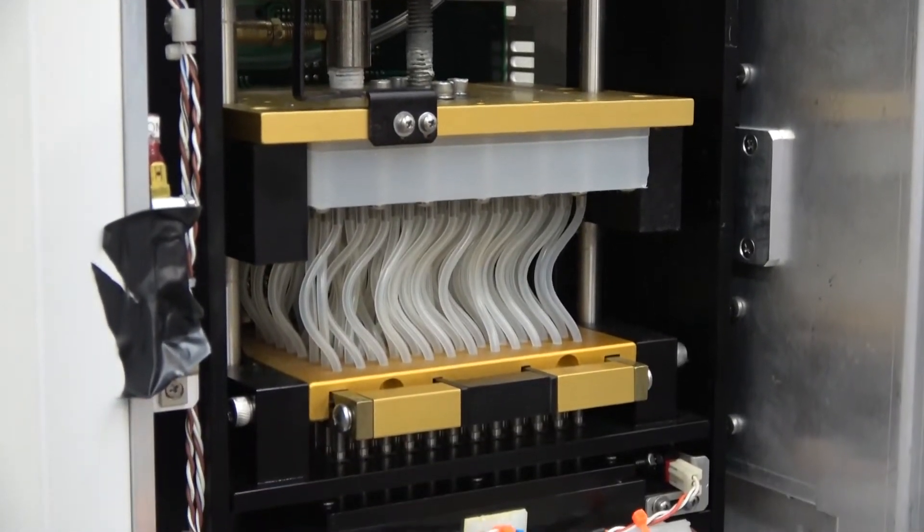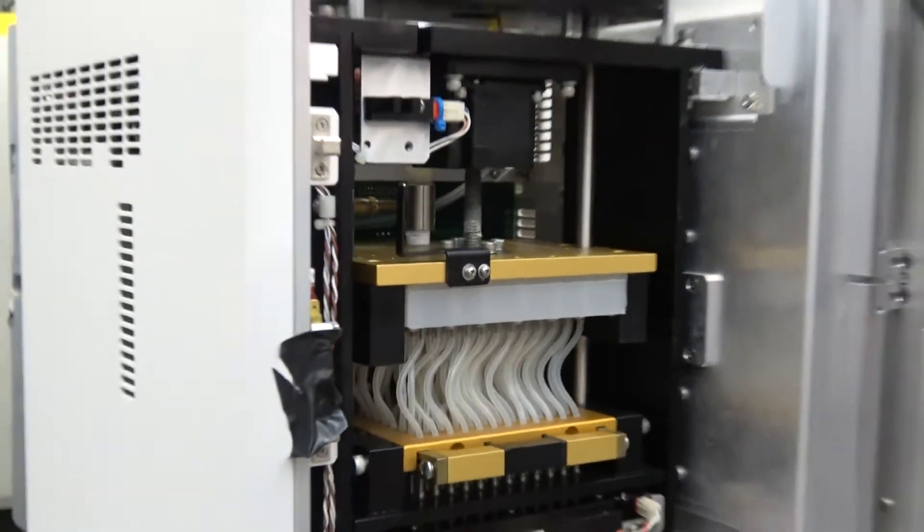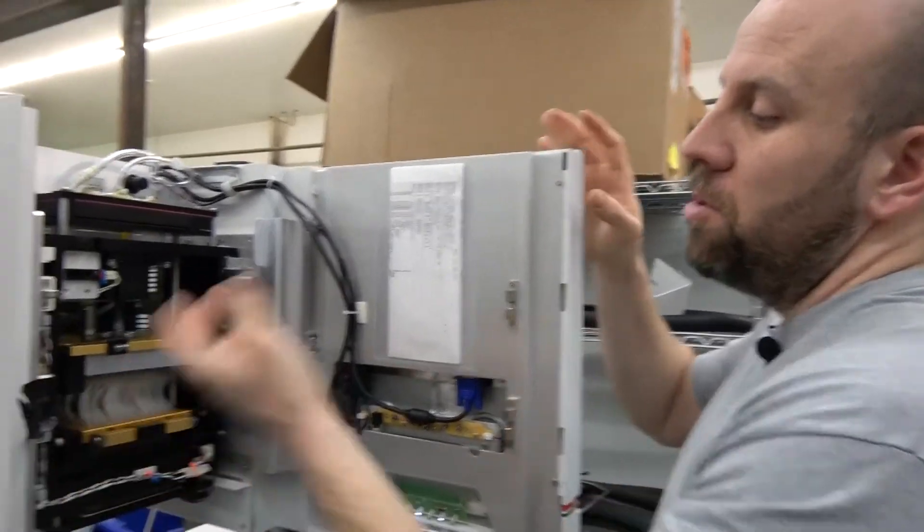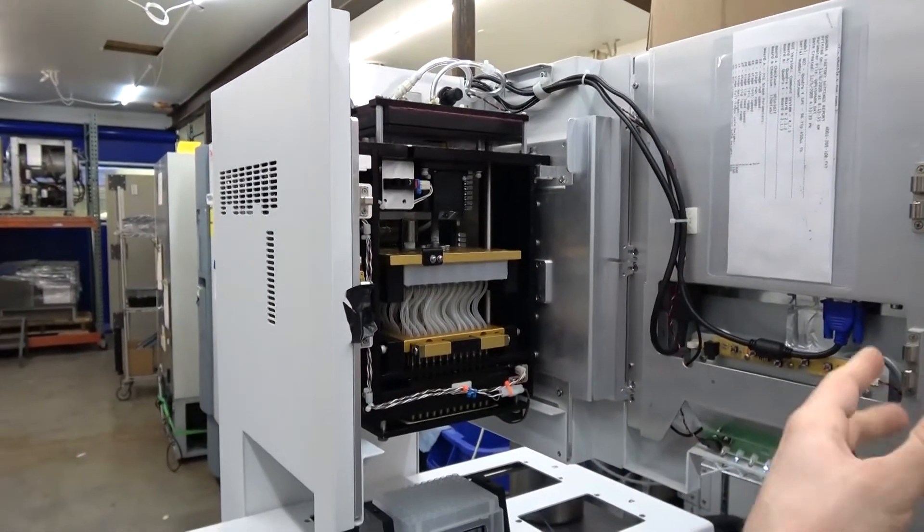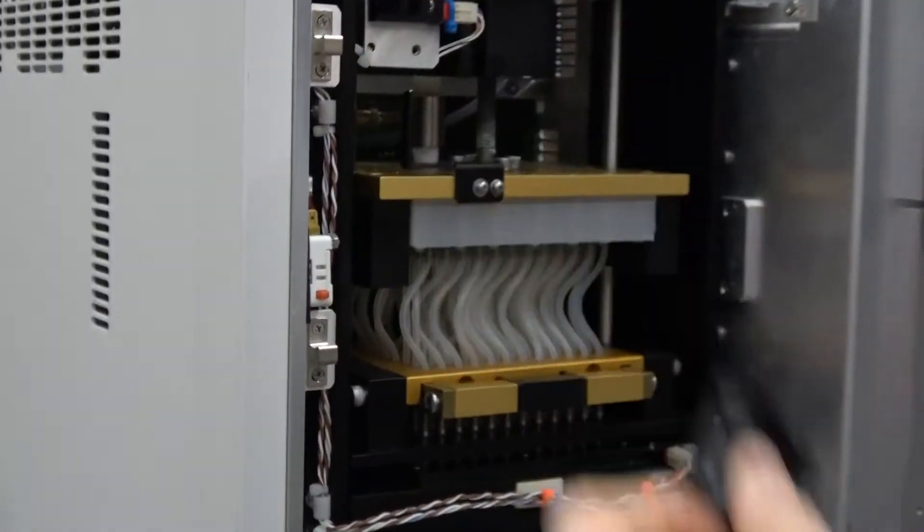You can also use nitrogen with these instead of the built-in air pump - an external nitrogen source. To have it operate while this door is open, we have to bypass this little switch.